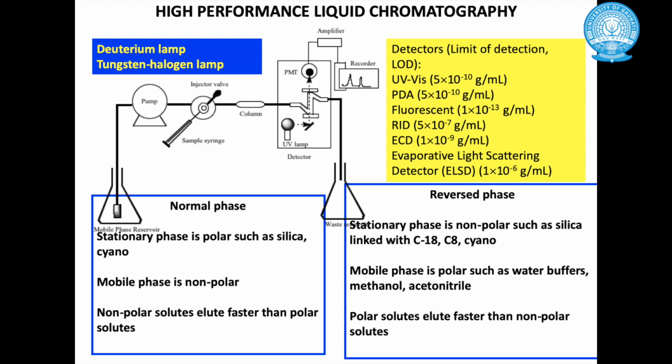So there are other detectors also, but at the heart of high performance liquid chromatography or HPLC is the column. The column has different chemistries.